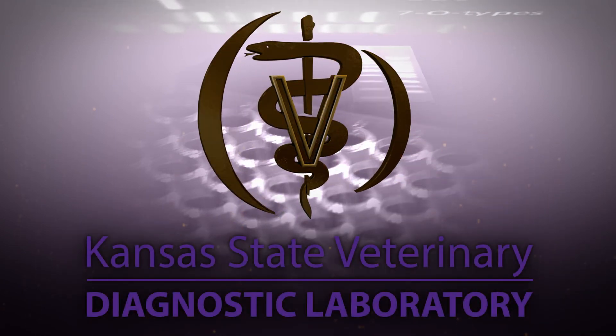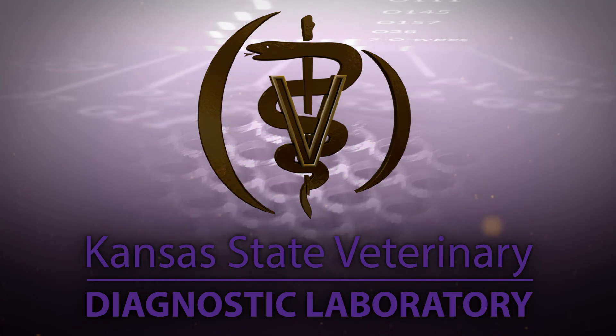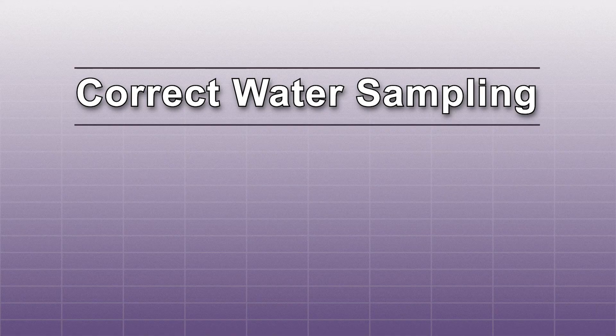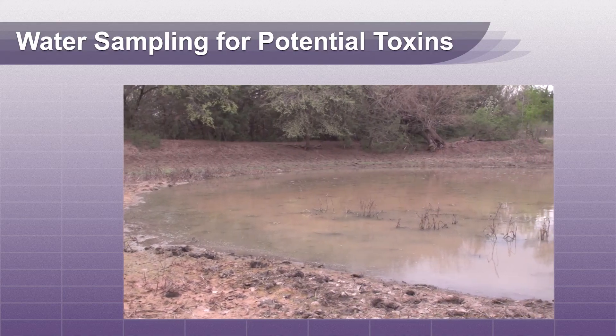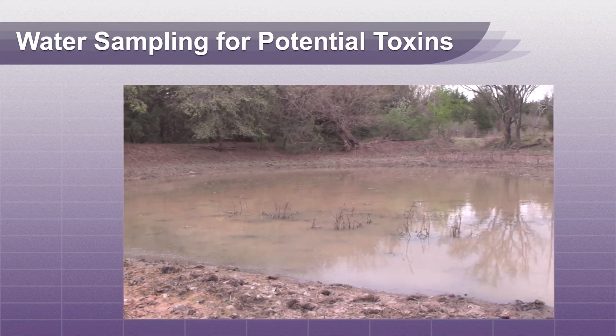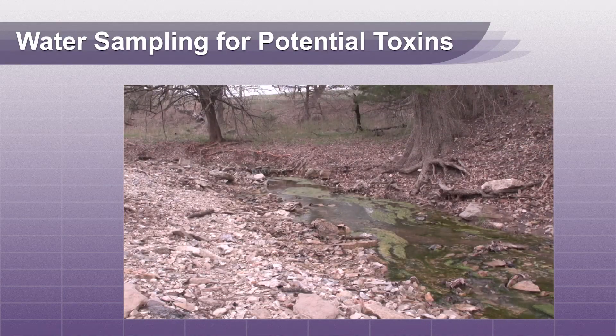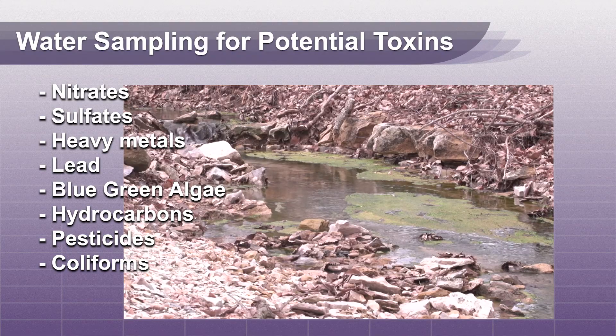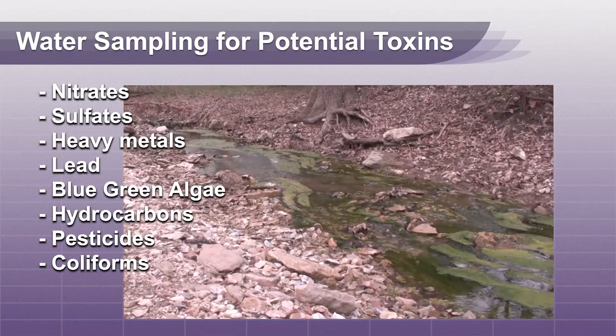Hello and welcome to the Kansas State Veterinary Diagnostic Lab YouTube channel. This video will describe the do's and don'ts of correct water sampling. Water is an essential nutrient for our animals and should be considered as a source of toxins like nitrates, sulfates, heavy metals, lead, and blue-green algae.